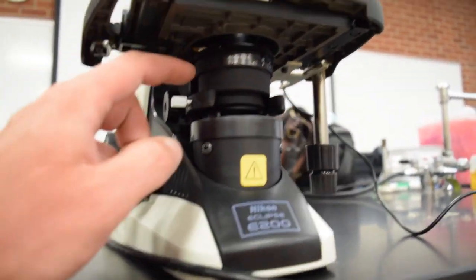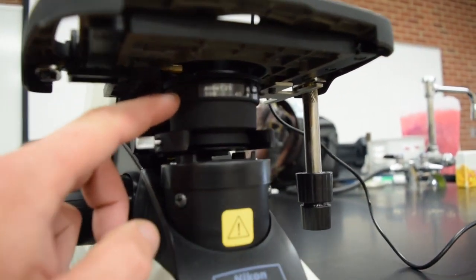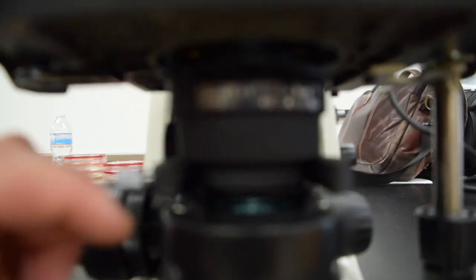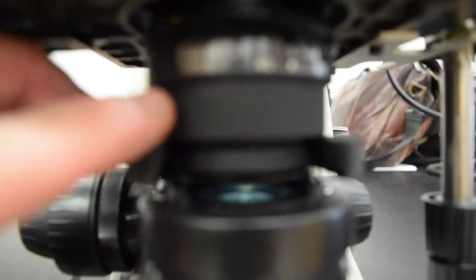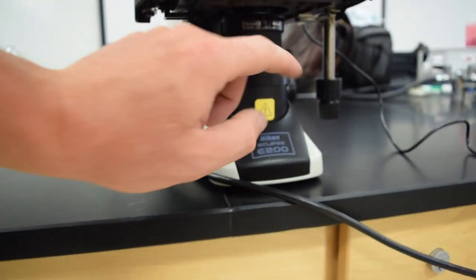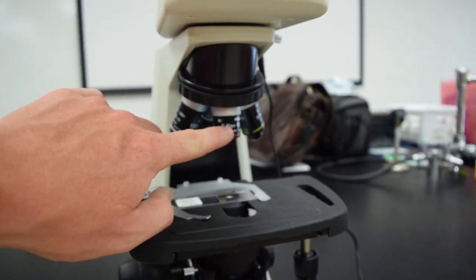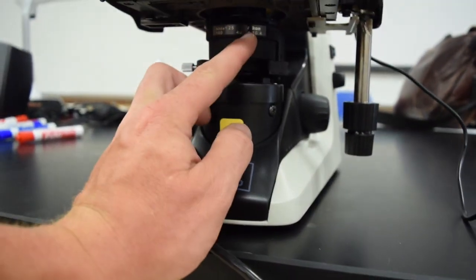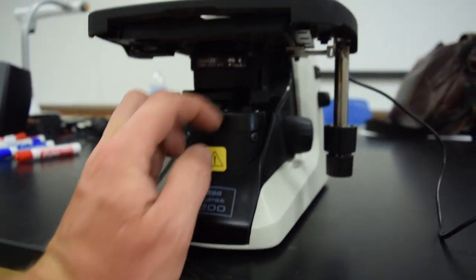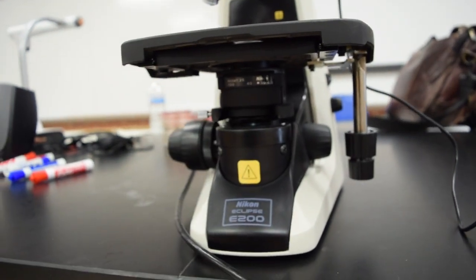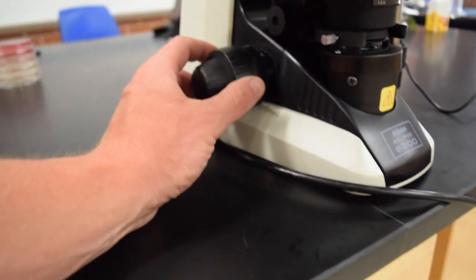Underneath the stage is our light condenser diaphragm. There's this little slider here on the diaphragm that you move when you move the objective. So if you're at the 4x objective, you move this slider to the 4 position on the light condenser.